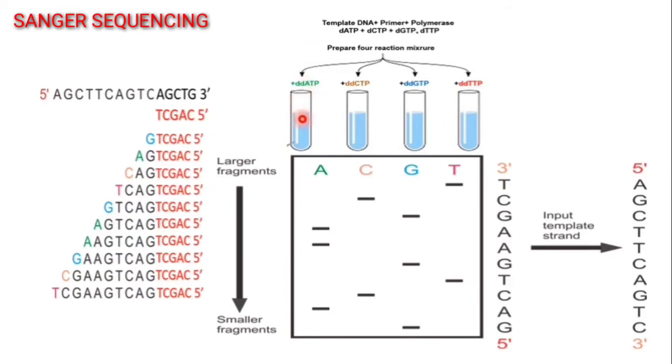After that, we keep these four tubes for reaction.